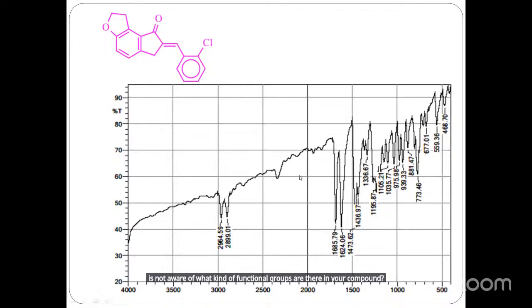So what you have to do is ask for the data file from the person who is analyzing your IR sample, and using that data file we can plot the IR spectrum using Excel, Origin, and these software tools, which help us identify each and every important peak so that you can explain it in your thesis.